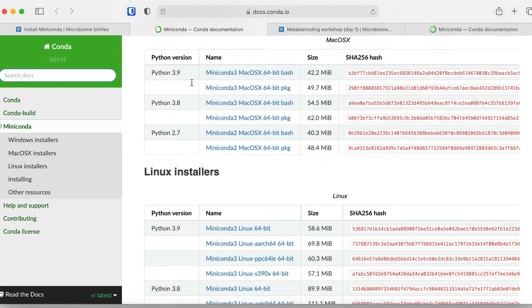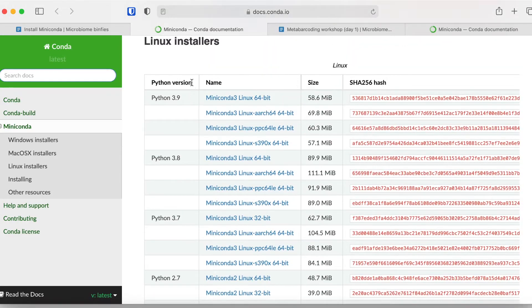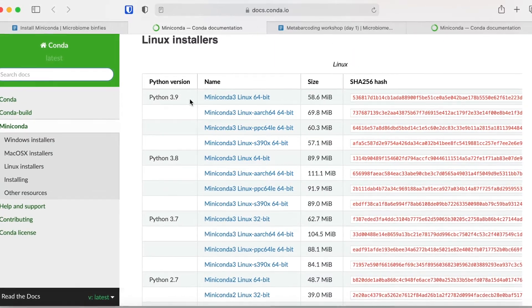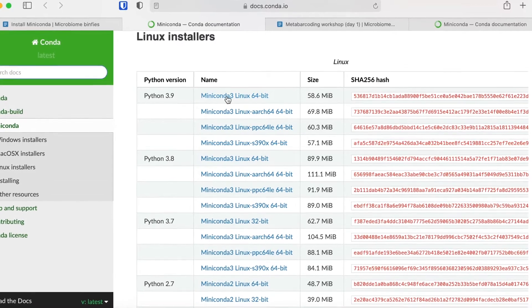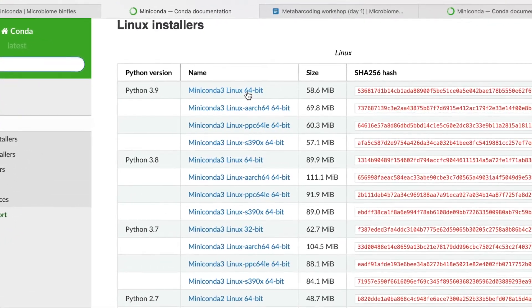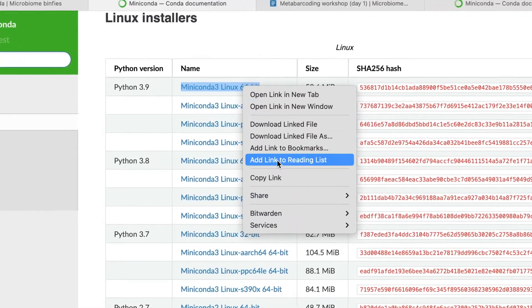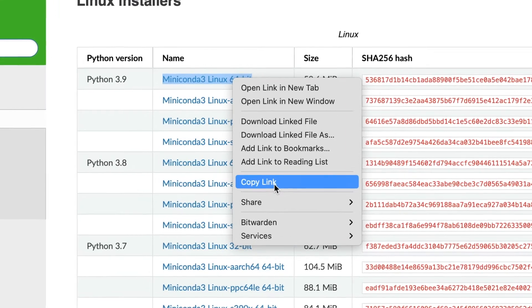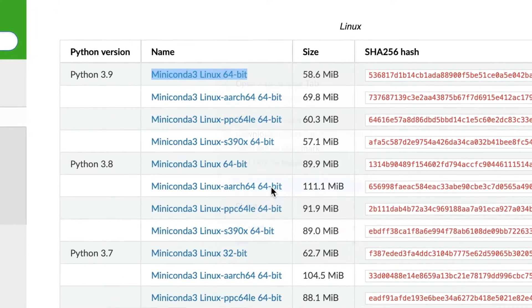We are using a Linux server and we will use Python 3.9, the latest version, Linux 64-bit. We can copy the link to the clipboard and then go back to the terminal.